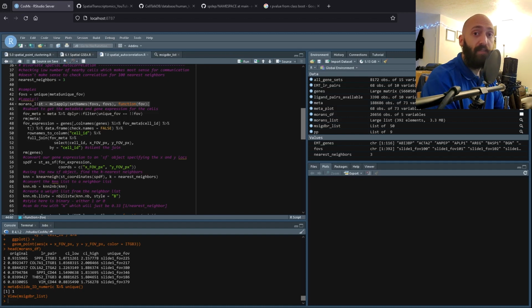But even if we have a single tissue and we're taking a bunch of fields of view from that, we want to treat them all separately, because tissue heterogeneity may cause structure to start popping out if we look at everything together. Different areas of the sample might have different characteristics that mute each other. So here, we're going to keep the fields of view separate. That's the main plug that I'm making there.